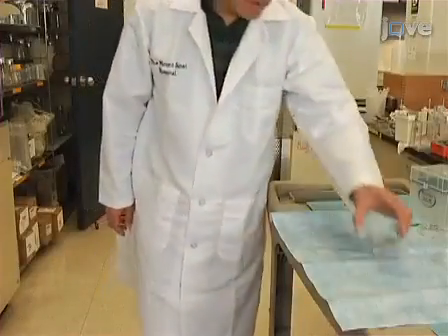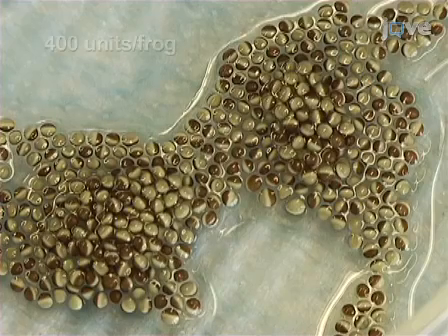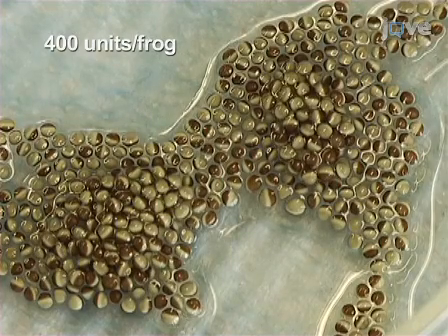To begin the process of in vitro fertilization, obtain eggs from female frogs that were injected with human chorionic gonadotropin 12 hours before the experiment.